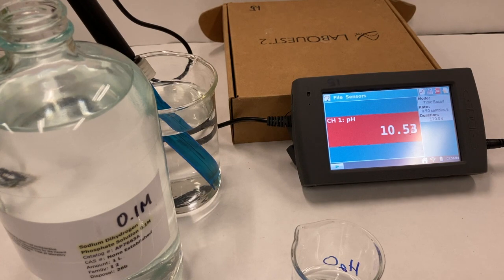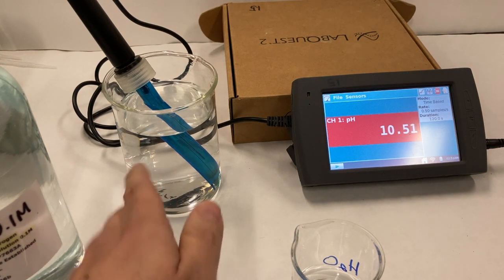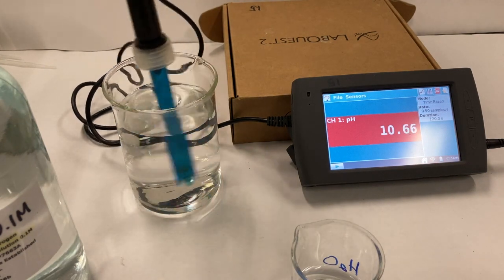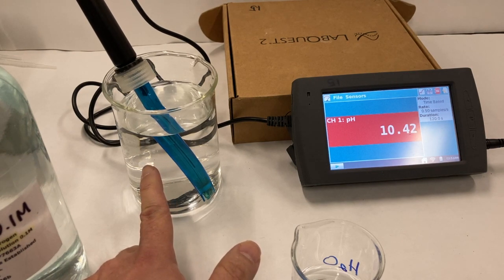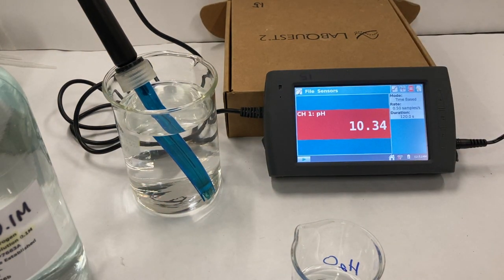All right, so we're just going to see a series of solutions being tested. One thing I want to point out though, is that I mentioned that I had a beaker of deionized water as my rinse. Now with these pH probes, the way that they're designed, they're not going to function well in low ion concentrations. Since this is deionized water, it's got a very, very low ion concentration, which means right now you're looking at the screen and you might think it says a pH of 10.36, even though this is water. The pH is not really 10.3. It's because it's not able to accurately read anything when there's not enough ions present. But that's not going to be an issue once we go into solutions, because all of these solutions have lots of ions present. So what I'm saying is ignore the pH of the probe when it's in the rinse beaker.